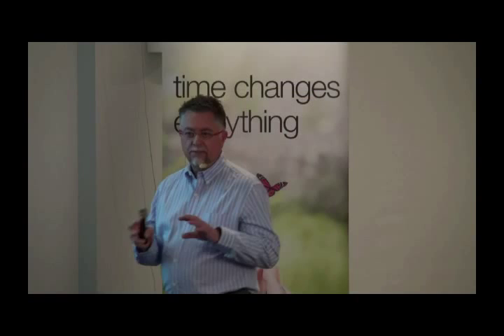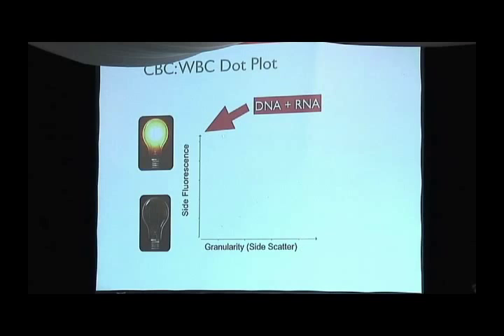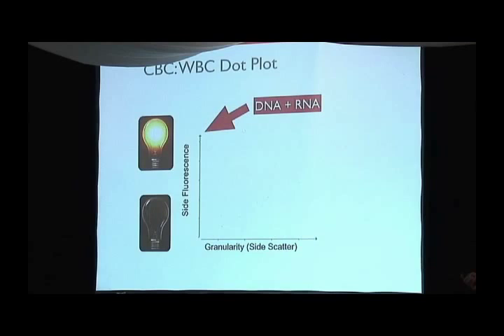So in addition to the RNA that you will find in the cytoplasm, you will find the DNA that is in the nucleus. So the bigger the nucleus, or the bluer the cytoplasm, the higher up those cells are going to be. Does that make sense, you guys? So if they are really huge nuclei with really blue cytoplasm, you will look for them up there. And that is where I look for neoplastic cells, all right?